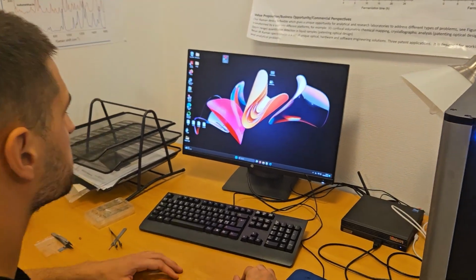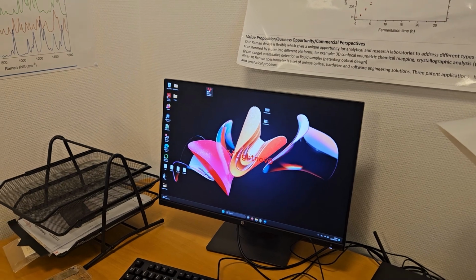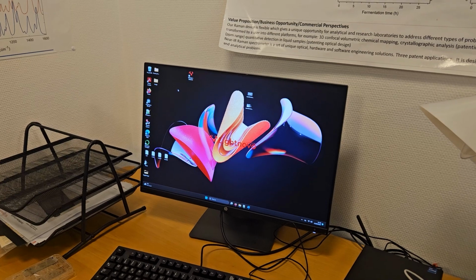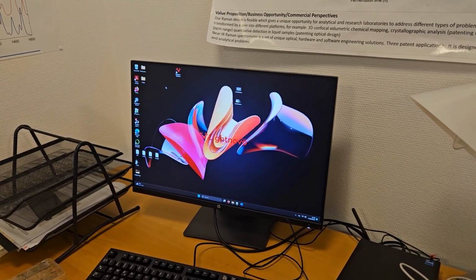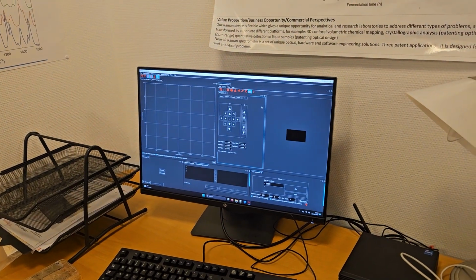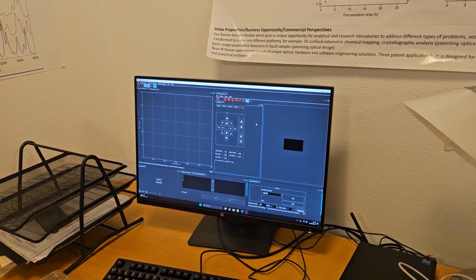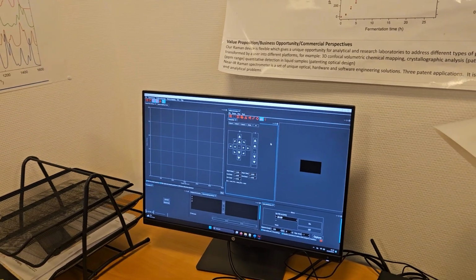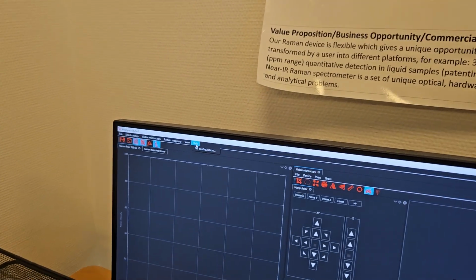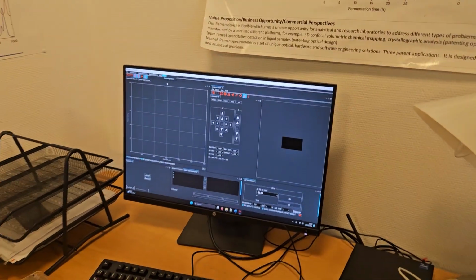So let's start the software. We click on the Mirror Spec shortcut on the desktop. So this software is launching. Let's wait, because our software can control a multitude of different Lightnovo instruments. Here we already loaded the proper preset for the RG microscope. I don't think we need to do it again, but Pascalis, you can show that you can do it from help. If you go to help, and then there is an option set configuration, but we're not doing that, and then you load the proper preset.